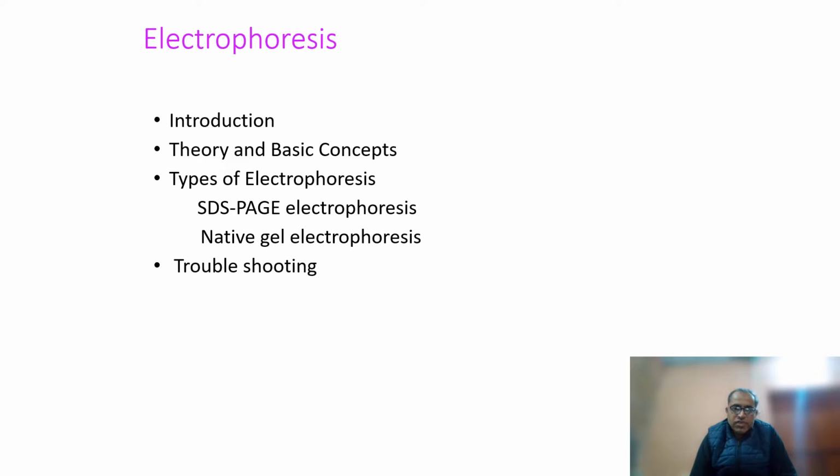in which V is the velocity of the molecule, E is the electrical field that is applied, Q is the charge on the molecule, and F is the frictional coefficient. Then we will see what the basic concepts are.